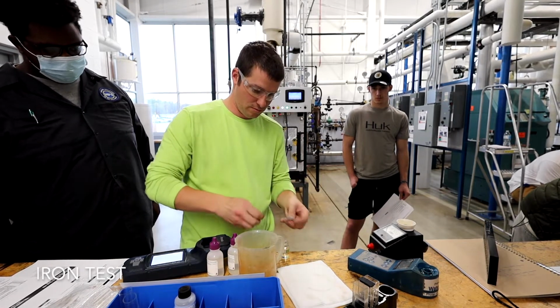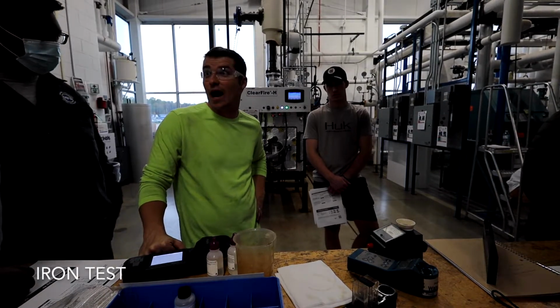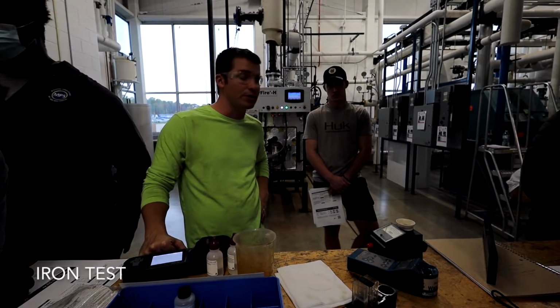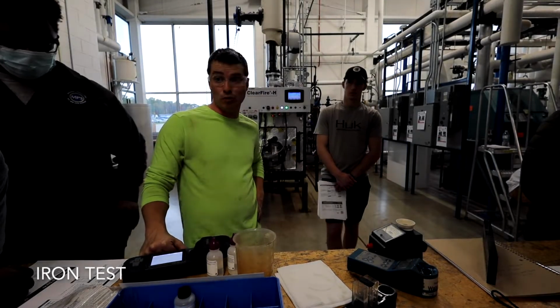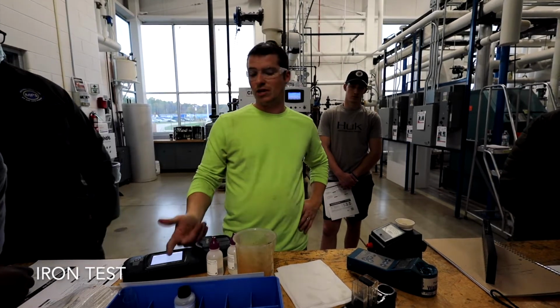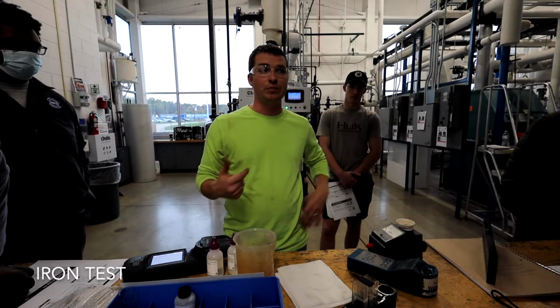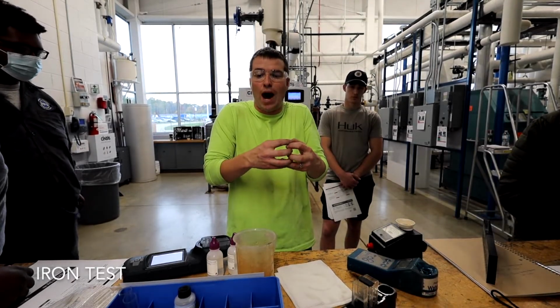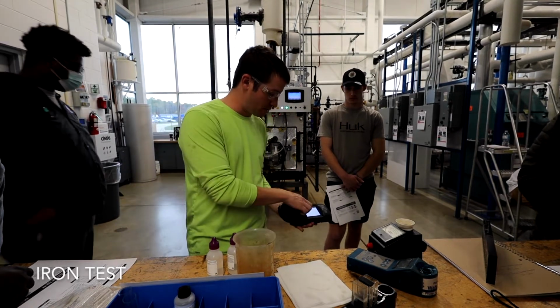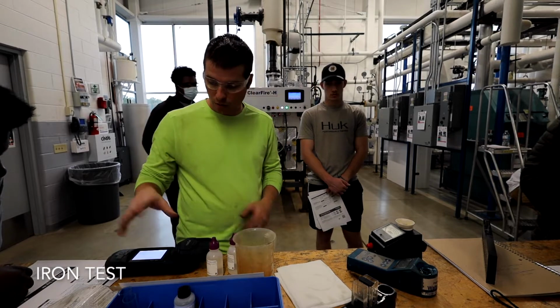So what do you think is orange? Made out of what? Steel, iron, right? Black pipe. You don't really have aluminum, you don't have copper typically, you don't have a lot of that stuff. You have mostly iron. So if we can maintain below a certain level of iron, we know that we really can't be having much corrosion occur, because we would have a higher iron level, right? My meter, again, it counts down, it's going up: 0.25, 0.26, 0.28, right? And so we'll let that go.